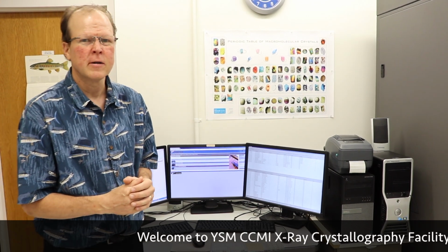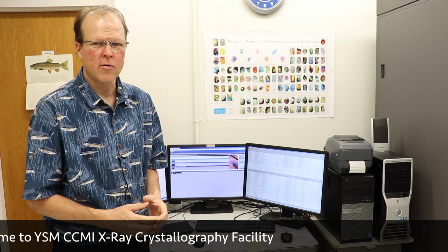I'm Jim Murphy, and welcome to another training session of the instrumentation in the Yale School of Medicine CCMI X-Ray Core Instrumentation Lab. Today we'll be looking at the RockImager 1000 by Formulatrix.